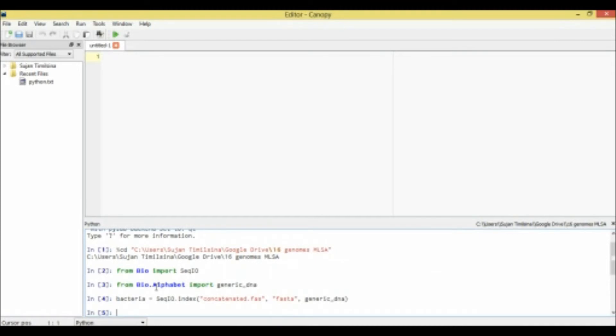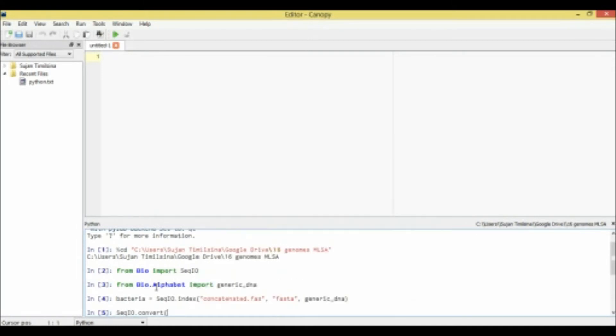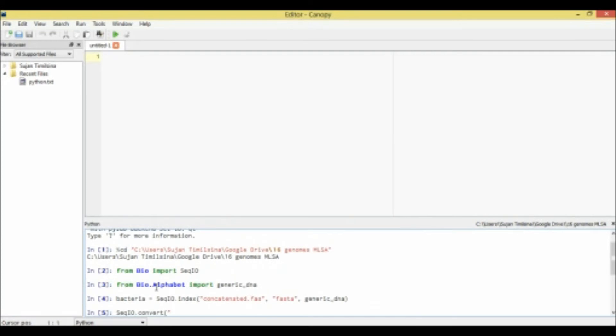So to convert the file format, what we can do is, it's really easy: sequenceio.convert, and your file format name that you have, which is concatenated.fasta, and its file format FASTA, and convert it to the output, which is concatenated.nexus file, and it's going to be DNA only, DNA sequence only. We will specify it as DNA.